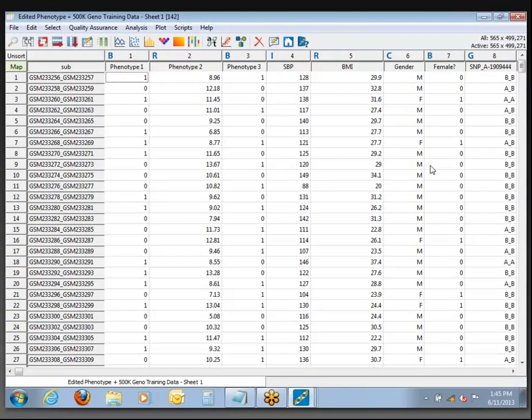At this point, we're going to select a set of SNPs to use for association testing. When we're doing association tests, we're going to use a slightly different set of filtering criteria than when we were setting up data for principal components. The first thing we'll do is set a dependent variable — click with your regular left mouse button directly on the variable name. The column should turn magenta, and that indicates it will be used as the dependent variable. So we're going to test for Phenotype 1.